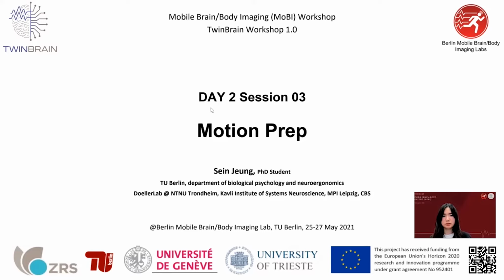All right, so the next session is motion prep. And this also includes a little bit of things that already happened while we were importing the data. So this might be going back a little bit in time. So when I was talking about the difference between source and raw data, there was some minimal processing performed on the data. And there are some special considerations for motion data.